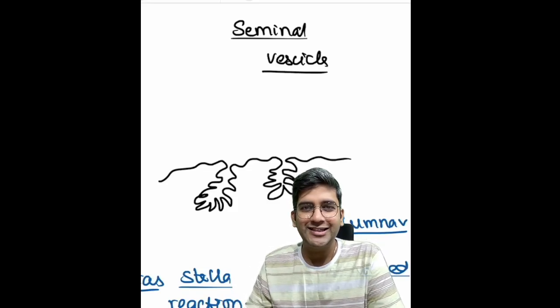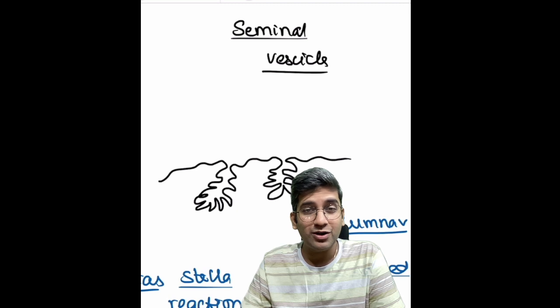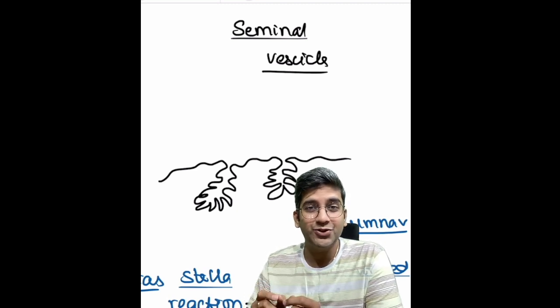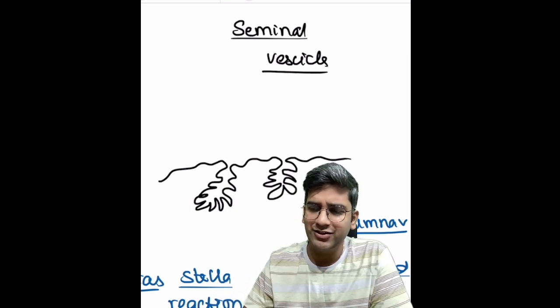So here we're going to see a very simple normal histological finding of seminal vesicles. There are some important points which I want young pathologists to keep in mind so that they don't get confused whenever they see a diagnostic slide, right? Let's deep dive into it.